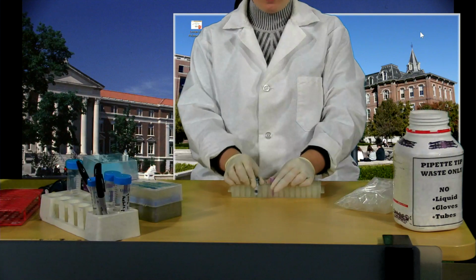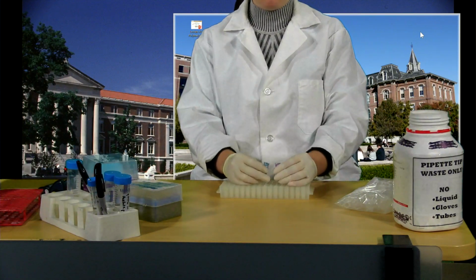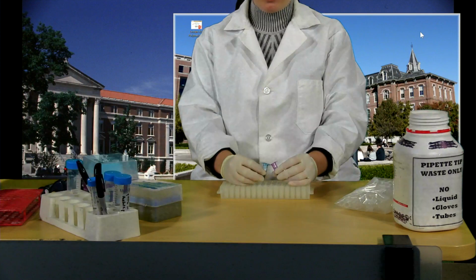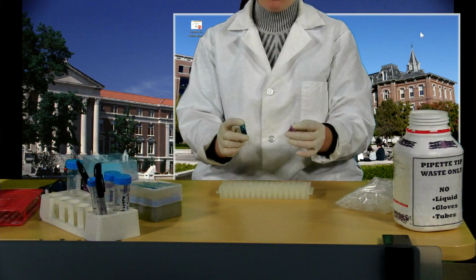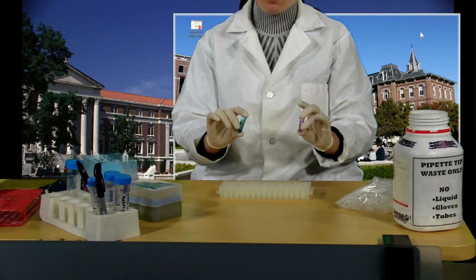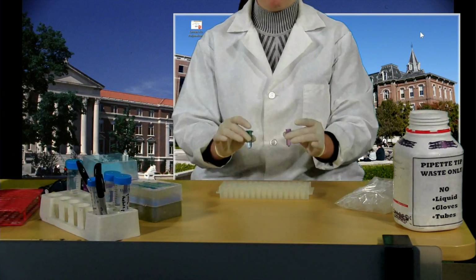Okay guys, so what we're going to be starting with at the start of our experiment are samples of two other solutions. So I have a crude sample and a purified sample here. One of the important things to remember here is that these are just samples. These are not the total fraction volumes as we've been referring to them in our experiments in lab over the past few weeks. These are just fractions of them.